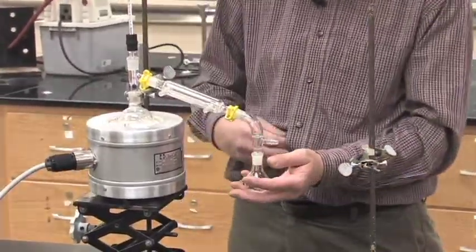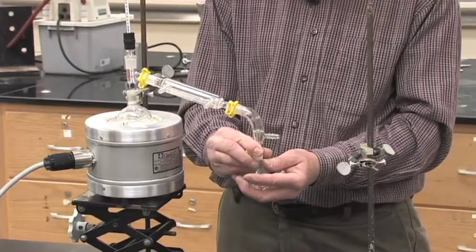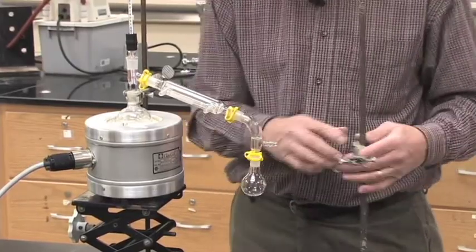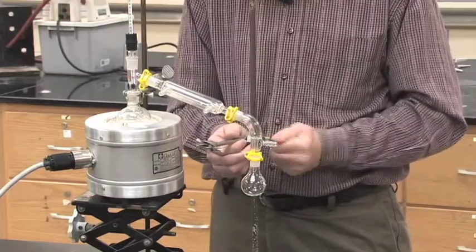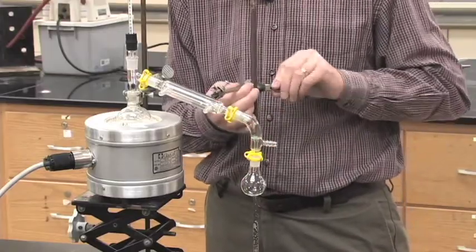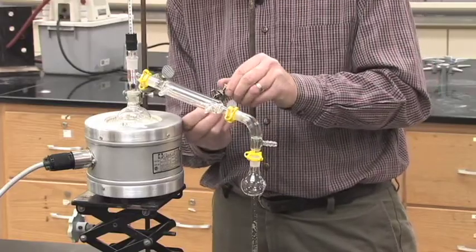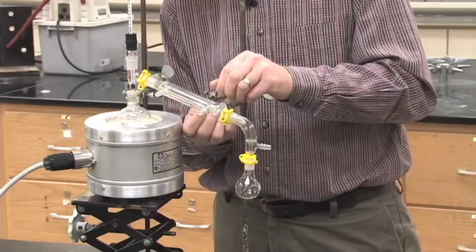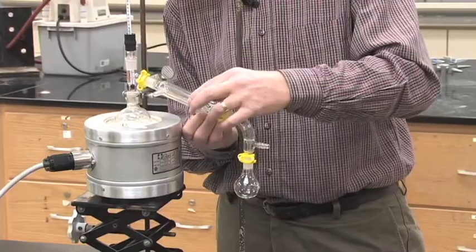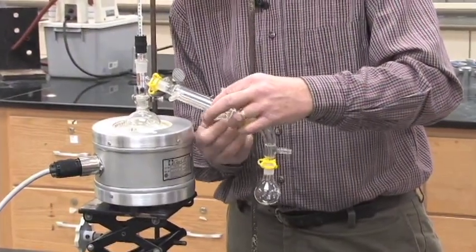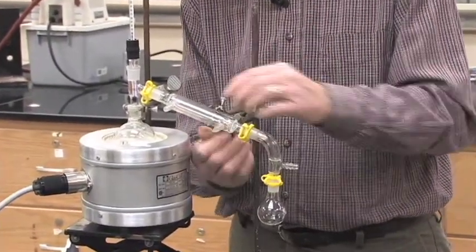And then you'll collect this into another round bottom that looks clean. And then you can put another Keck clamp on that holding it together. And then to make sure we have enough support for it, we can put a clamp on our condenser to hold everything up to make sure everything's good and secure.